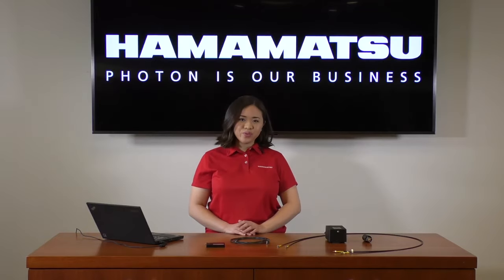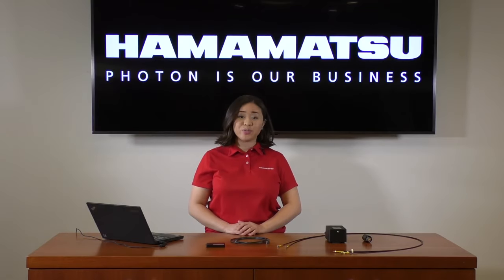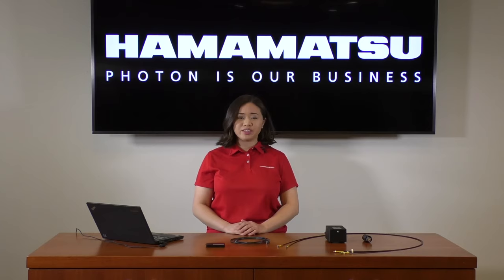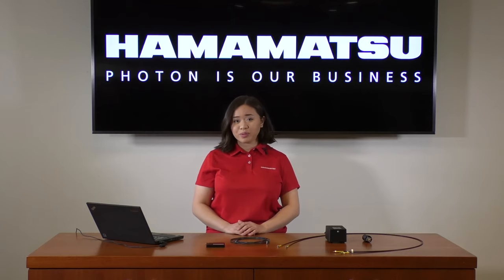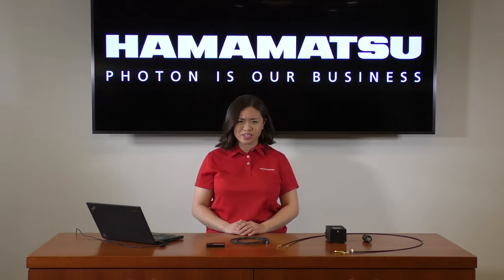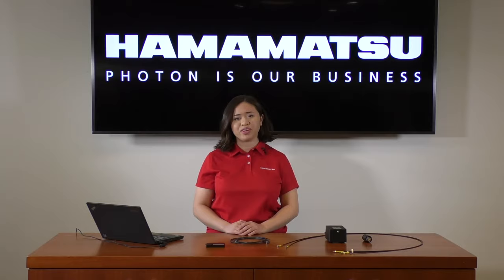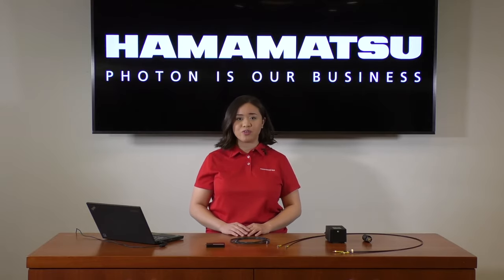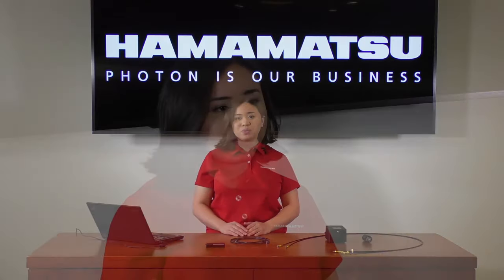Today we'll be presenting one of our spectrometer options. We'll share an example test setup, run through some sample data to give you an idea of what type of analysis is possible using our standard evaluation software, we'll introduce some alternative evaluation software options, and discuss possible applications using this spectrometer.